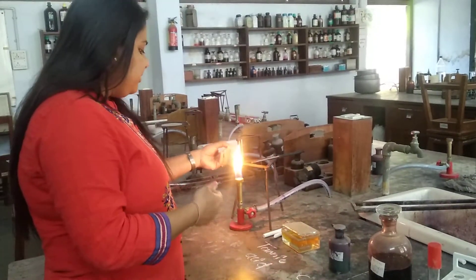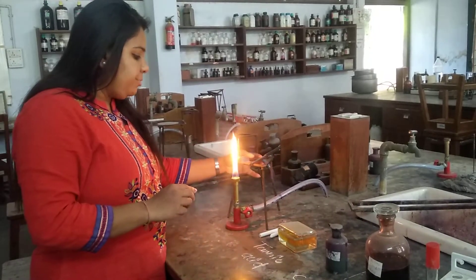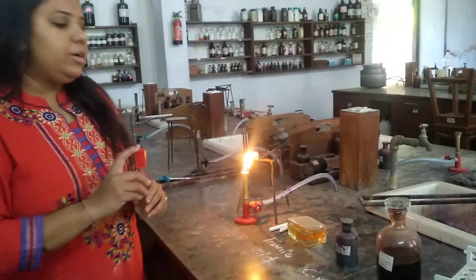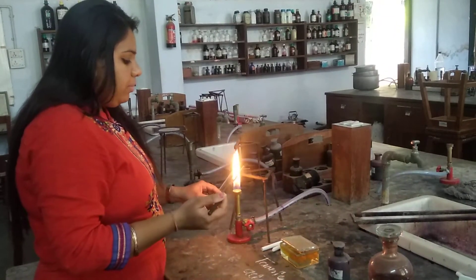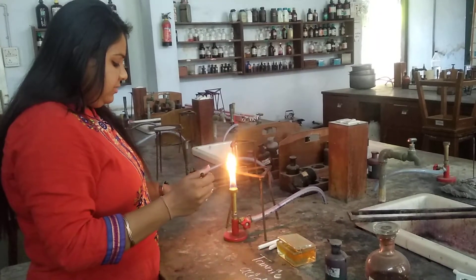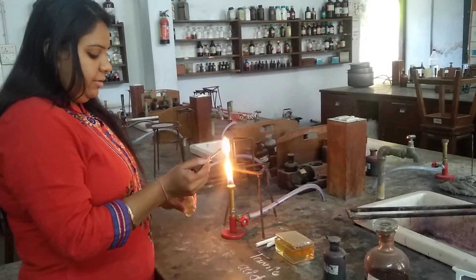Now we need to prepare the smear. For that, we have already red-hotted the inoculation wire loop. We have to take an 18-hour old culture and then prepare a smear. Make sure that you always use a burner while taking or collecting the smear. One loop full of culture is quite fine.